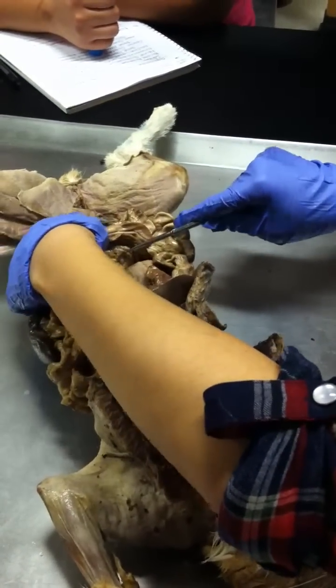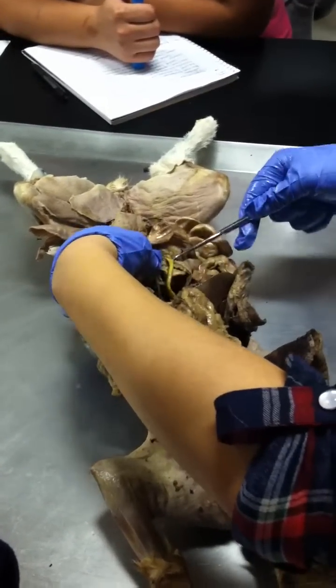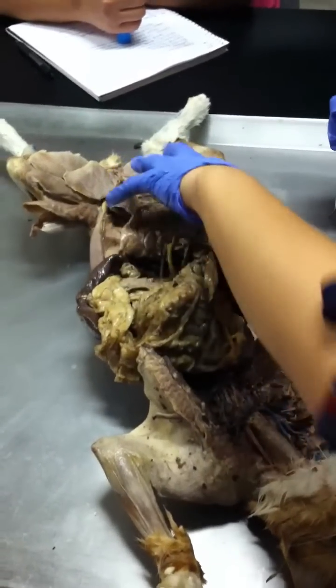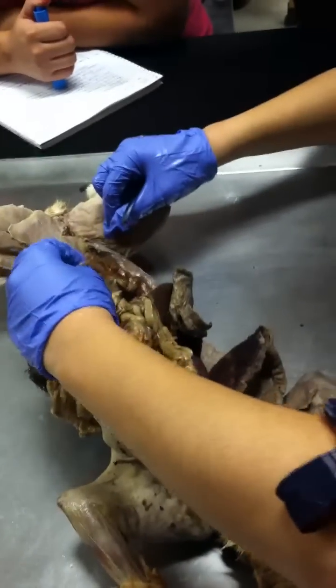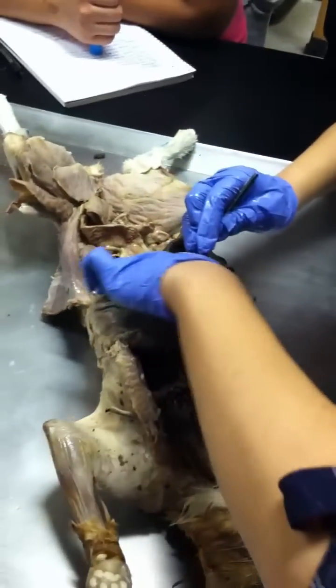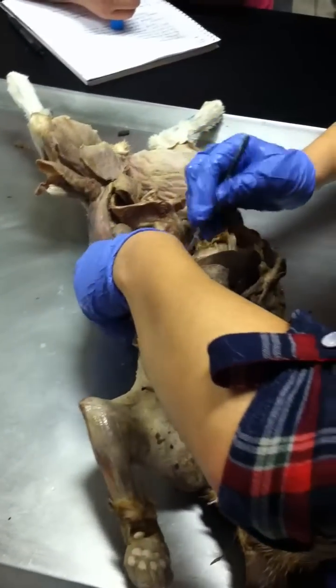And then the other branch right here coming down, right? The next branch would be the what? Superior mesenteric. Superior mesenteric. Any of these branches, right? Superior mesenteric. Okay. Excellent. And the inferior mesenteric, probably, I'm not going to pin it. Letting you guys know. On the other side, ooh, where's the first one?